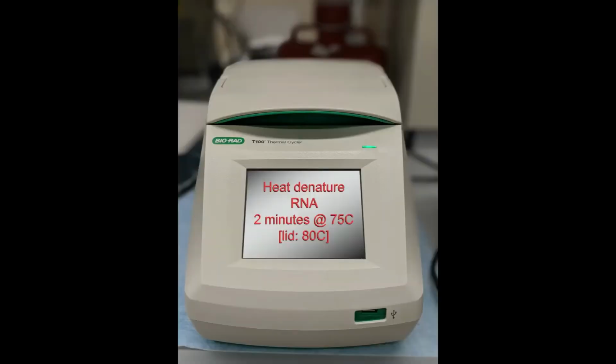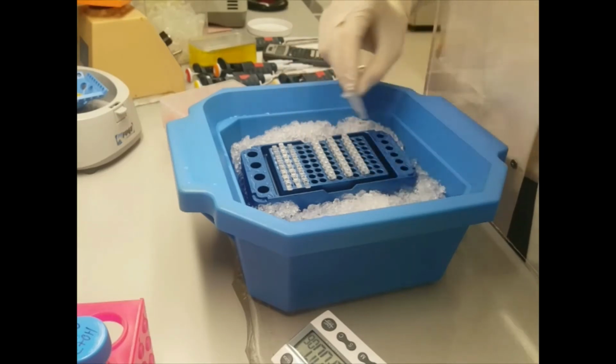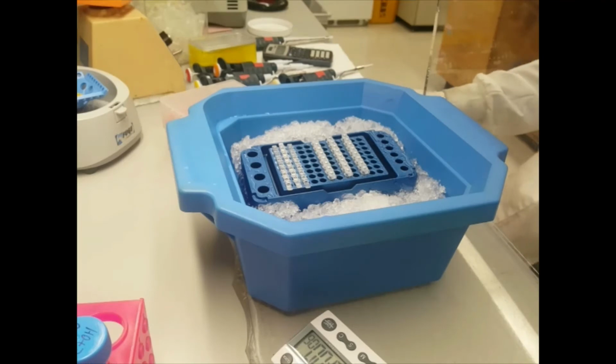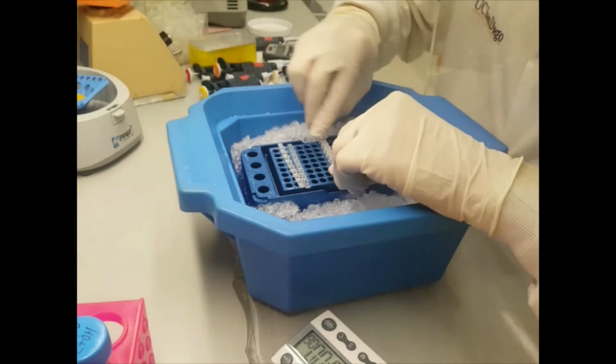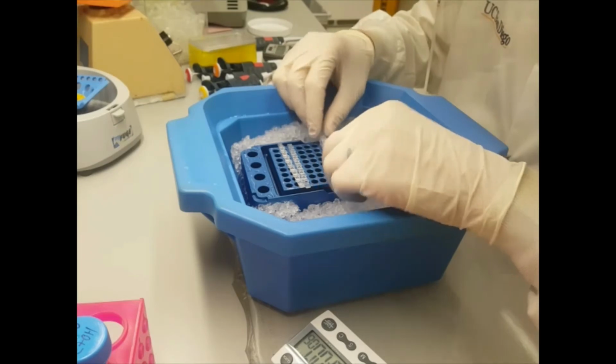The next step is absolutely critical to further deplete microRNAs. Heat the RNA beads in TET at 75 degrees for 2 minutes and then, as you did before, quickly place them on ice. This repeated denaturation helps to further deplete particularly the microRNAs, as their secondary structure often protects the 5' ends from dephosphorylation or the 5' terminator exonuclease.